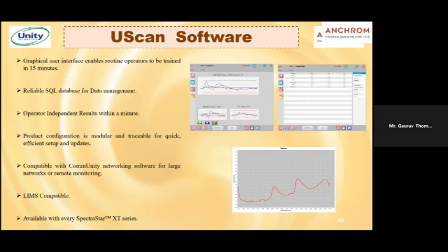So the QA person would be looking for something else, the QC person is looking for something else, and the production people would be looking for some other parameters. But they would have these parameters in common, but the values for these parameters would be different, right? So this LIMS compatibility ensures that, department-wise, all the data gets segregated and easily reaches the person who's looking for any data from the whole compilation of results.